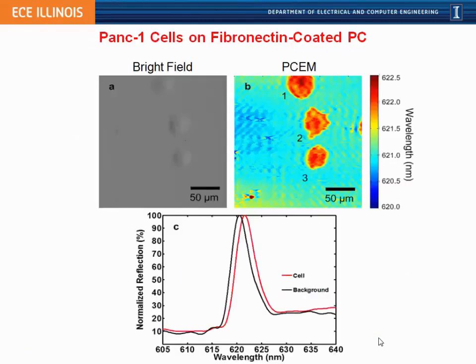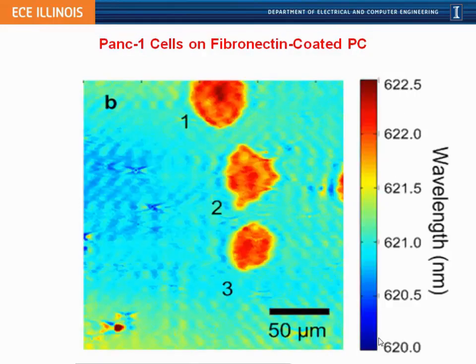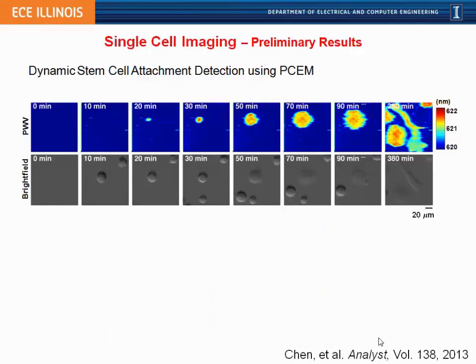The resulting image shows pancreatic cancer cells: a regular bright-field image alongside the photonic crystal microscope image, where units are peak reflected wavelength value. Where a cell is present, the wavelength is shifted compared to cell-free areas. Zooming in reveals interesting features — cell outlines where filipodia and lamellar extensions reach out, and within individual cells there are places of higher versus lower attachment density. We can observe a wide variety of interesting cell attachment behavior.